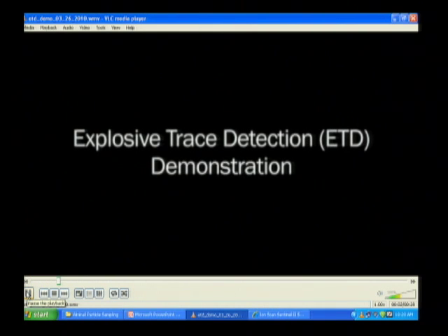So we're going to deposit some particles. You can't see them unless you use UV irradiation, amber light visualization. It's the only way to see them. So we're going to ask you to collect the particles with the PSPME swab with and without the aid of visualization. See how you do. Okay, so we have some exercises planned for you. And I'm going to show a video right now on how ETDs are normally used for collecting particles off of people's hands, for example.